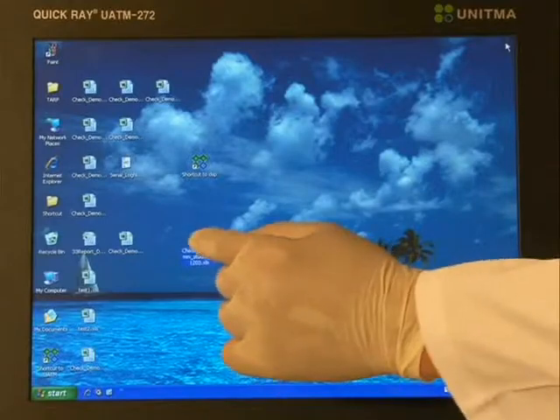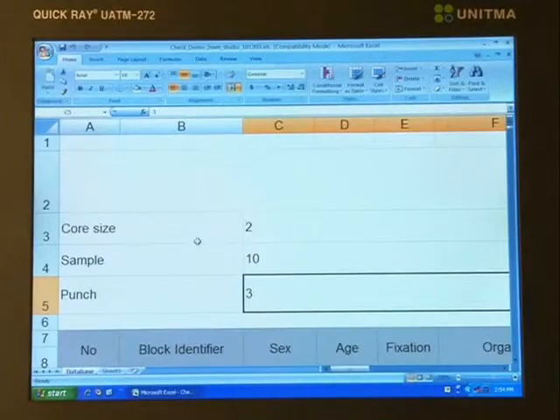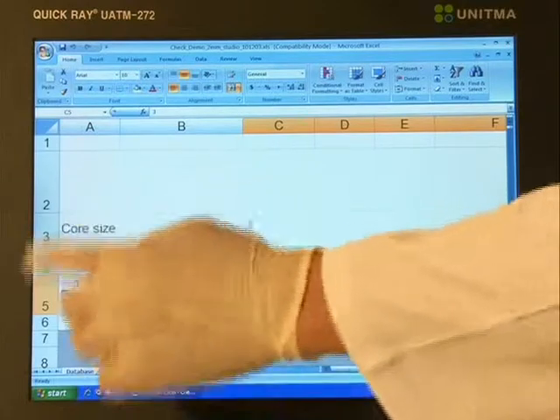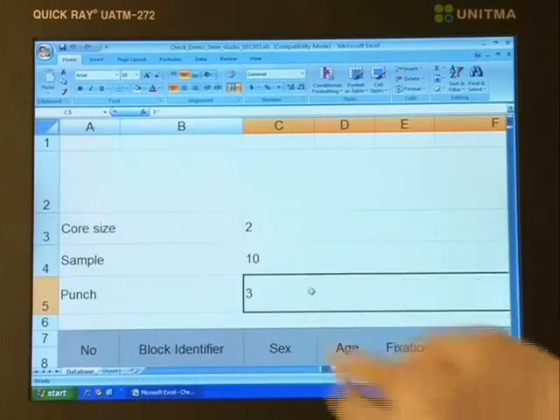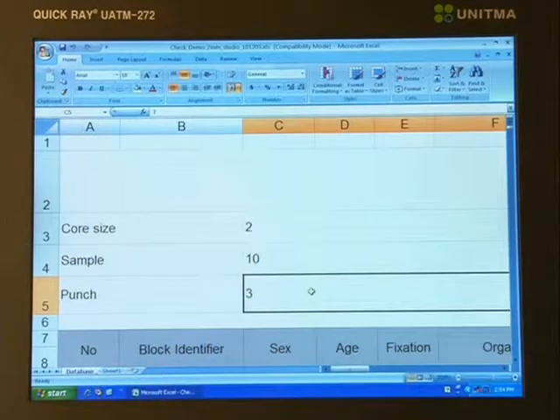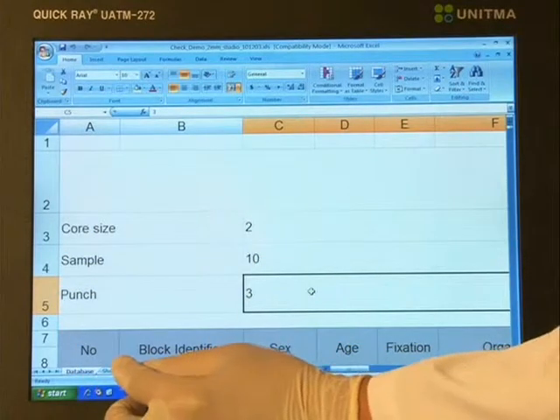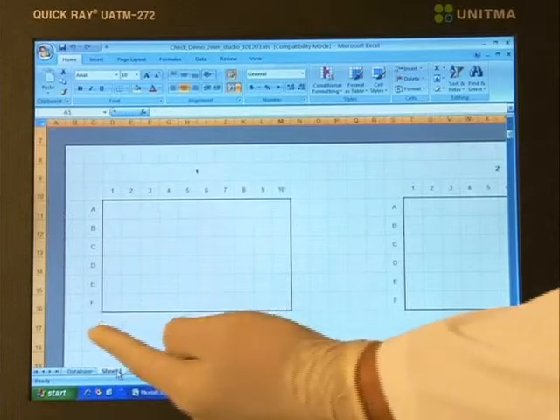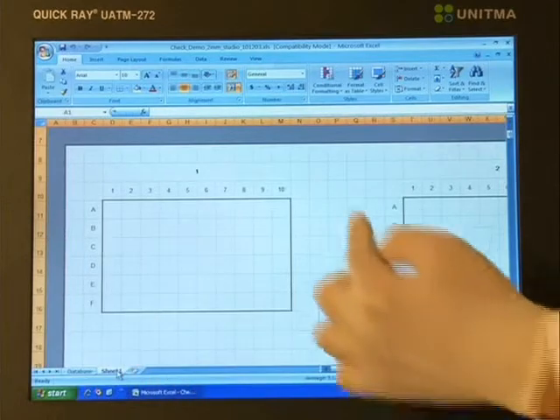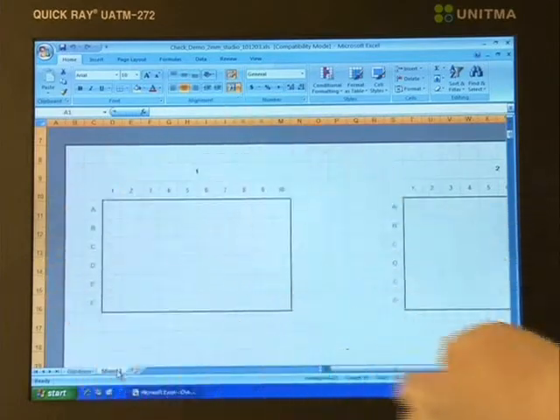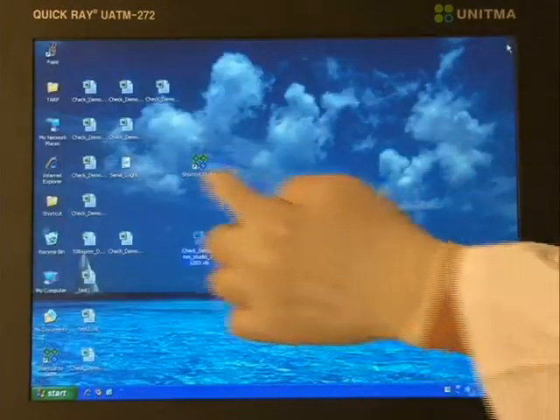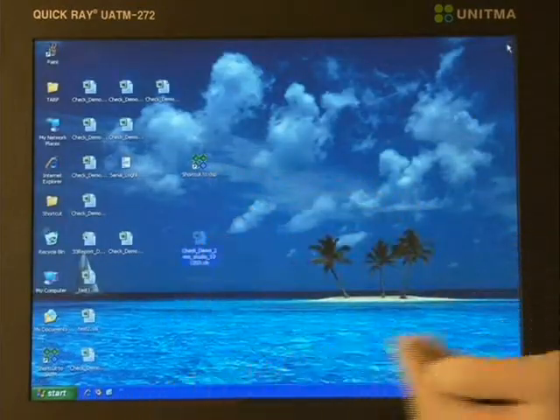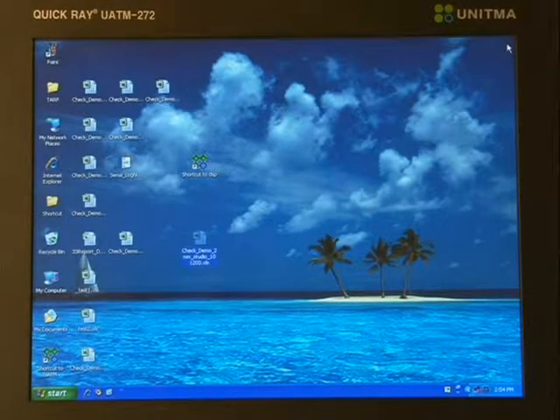This automation is available with only three parameters of TARP — Tissue Array Report Program: the core size, number of donor blocks, and number of tissue samples in each donor block. After this work is finished, the information on the donor block inserted into each recipient block hole of the TARP file is renewed and saved. This TARP file, in Excel format, can be used in various ways.